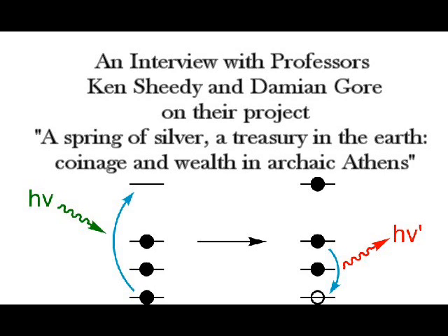At the same time, Damian Gore here was working with the Museum of Ancient Cultures in our museum, and we knew from earlier work he had done, I think, with silver and bronze in the collection of the museum, that he was very interested in the application of XRF techniques for the study of ancient artifacts. So we sat down and worked out what was possible and learnt about the promise of the new machines. And from that, we realized that there was potential there to really make an impact in the study of numismatics.